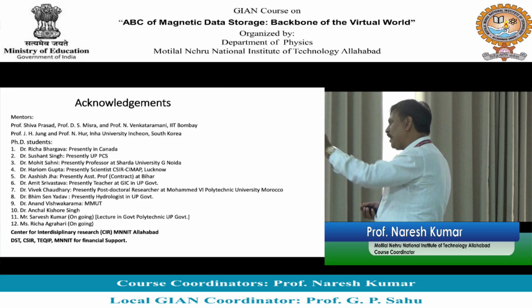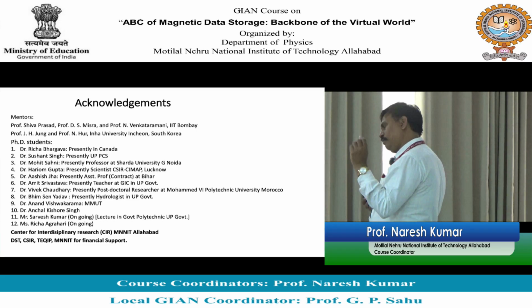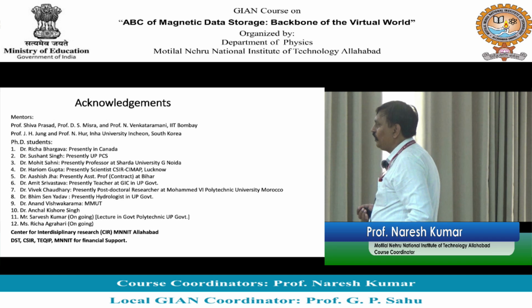So I will check with cubic. मान लीजिए cubic नहीं मिल रहा है, then I'll see whether orthorhombic is forming or not, or tetragonal is not forming. So I have to check. It's not like मैं assume करके चलूँगा. It is not the case.